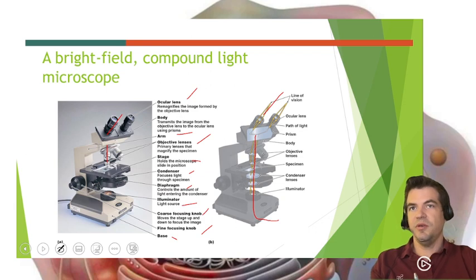Real quick, use this, pause it at certain parts if you need to. You will want to be able to identify parts of the microscope on both exams and the lab quiz and the lab practical.